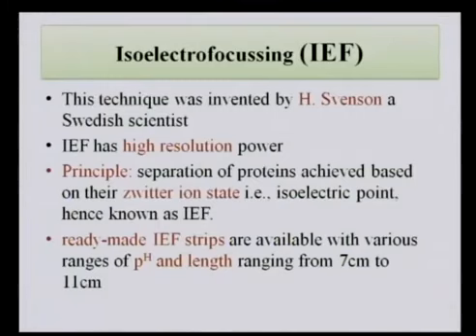In our previous session, that is separation techniques 3, we discussed the separation of proteins based on SDS-PAGE as well as paper electrophoresis. So here IEF stands for isoelectric focusing. That means we are going to mainly focus on the isoelectric point of the proteins. Coming to the history, this technique was invented by H. Svensson, a Swedish scientist. This technique has the advantage of high resolution power. We will later see what exactly is meant by the high resolution power of IEF.